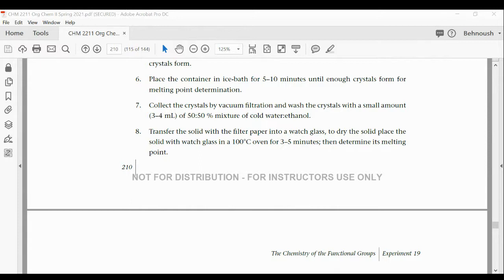You can make one table for the reagents that you're adding, so you have your 3 compounds and you have the reagents all in one table. The first one is the 2,4-dinitro, the second one was the Tollens reagent, the third one was the iodoform test, and the last one was the chromic acid test. So you could have all the observations in one table, and there's no numerical value. It's just the observation that you would add to each corresponding cell. Thank you. You're welcome.